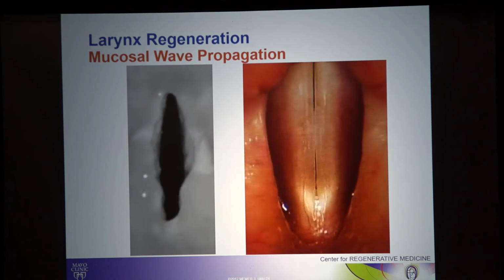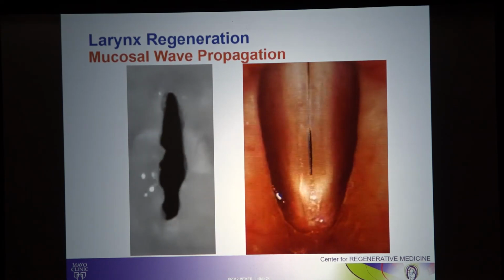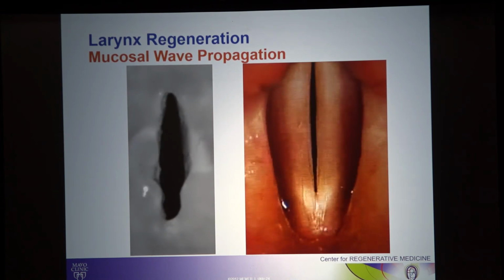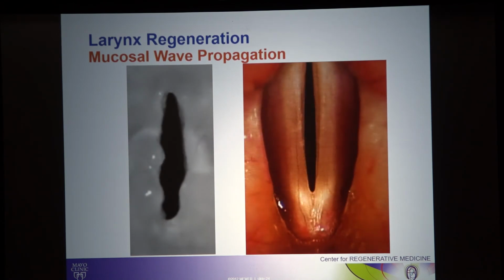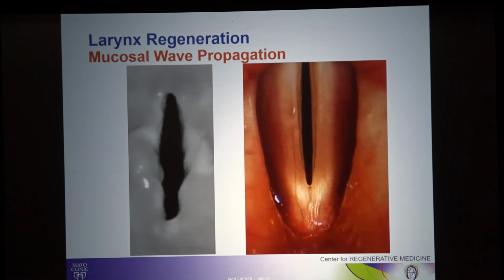Our bioprinted construct is in black and white, and the normal vocal folds are there. So you see what's called a mucosal wave. You see that vibratory capability of the vocal folds. Then you can add that into the area where the vocal fold ridge was to get that to function properly. And again, all these separate steps we talked about need to be documented throughout, to be able to show reproducibility of that.